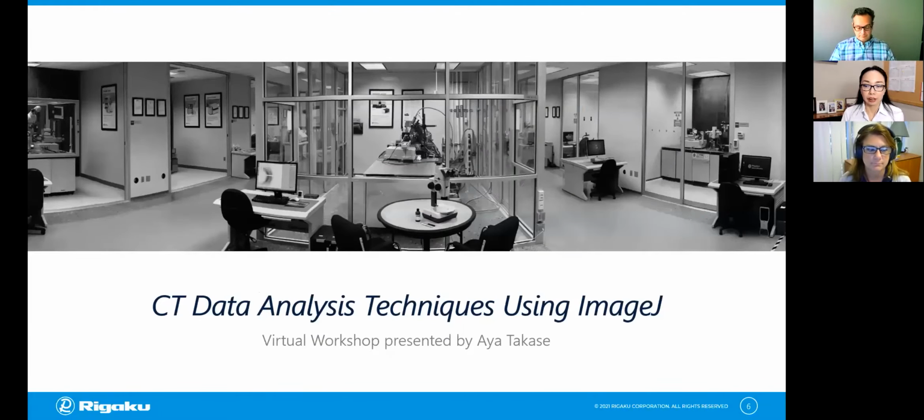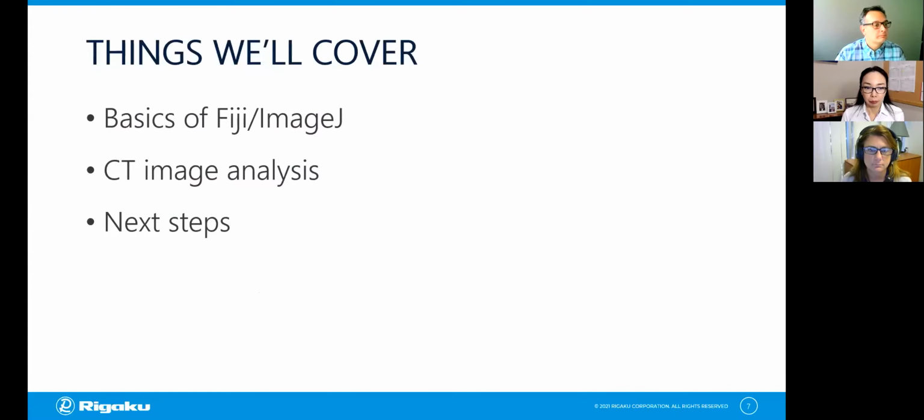Thanks, Tom and Angela, and thank you everyone for attending the workshop. Today we are presenting live from our office in the Woodlands, Texas, and I'll be demonstrating CT data analysis. What we're going to cover today includes some basics of the Fiji or ImageJ program, and we will do some CT image analysis. And we want to talk a little bit about next steps you can take if you decide to get into this a little bit deeper.